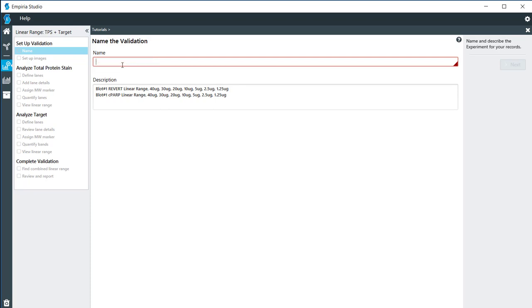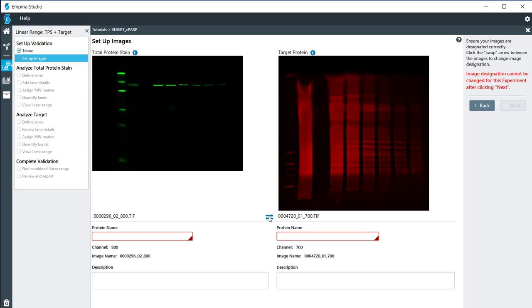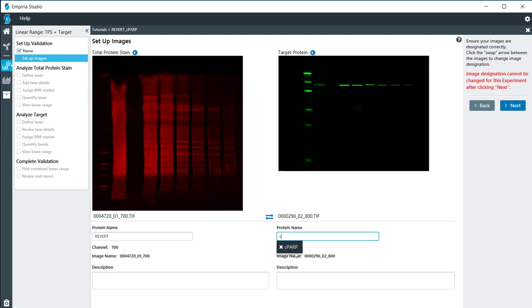I need to name this validation so I'm going to call this revert and then CPARP because that's what was used on this membrane. For here, if the images have been swapped and the revert was actually here on the right, you could click on this and switch these back and forth. I'm going to call this revert and then this is CPARP. If you have it already in the list, you'll see a drop down right there with the names present.